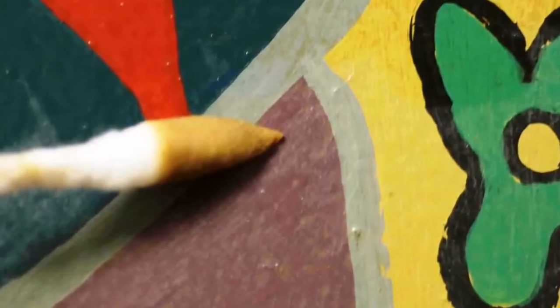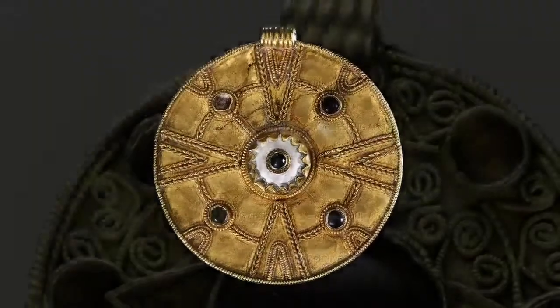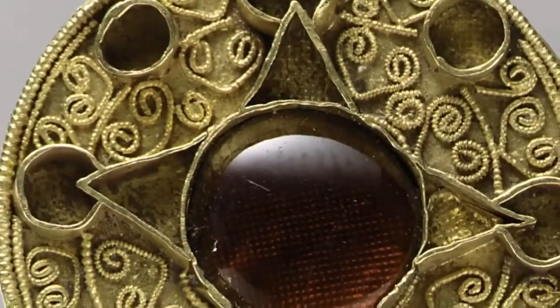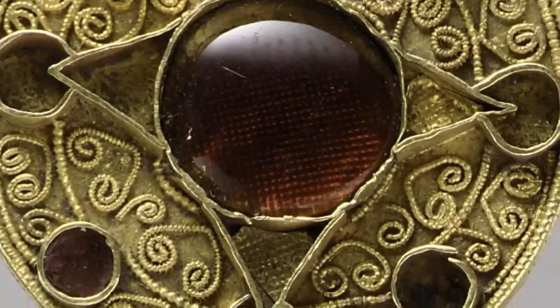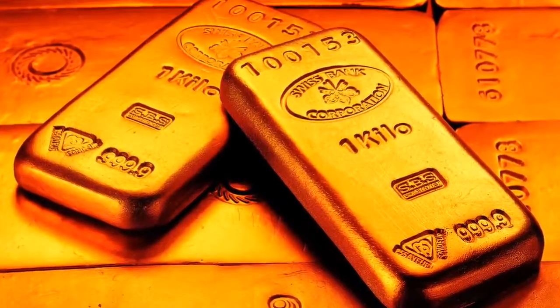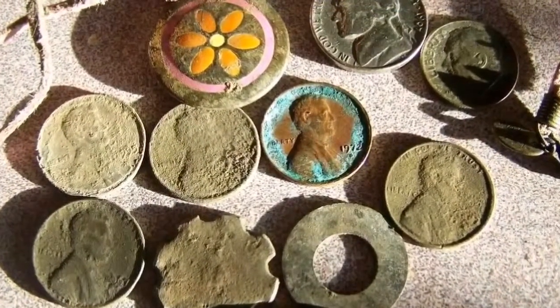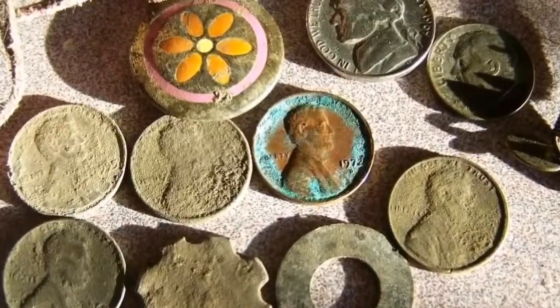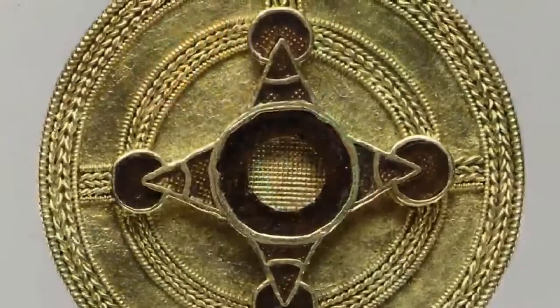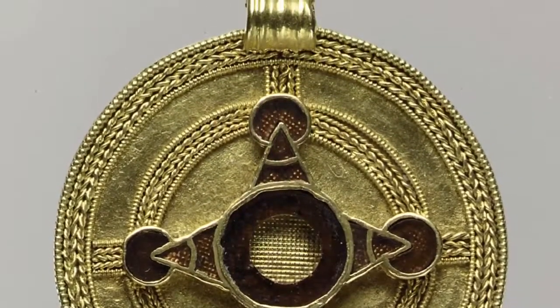Jewellery from the Anglo-Saxon world is famous for its golden lustre. However, this gold came from somewhere, and often Anglo-Saxon jewellery is thought to have been made from melted down Frankish or Merovingian gold coins. Merovingian gold coins are known to have declined in quality through time. Bit by bit the gold was diluted, and eventually fairly common metals were being added to the mix to make the gold go further. EDXF can analyse the amount of impurities in the gold, and when compared to the look of the brooch we can confirm it was made from coins in the 7th century. We can even confirm that the loop on top was made from a different gold source.